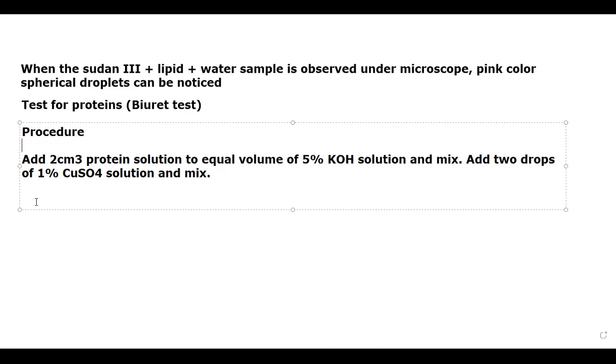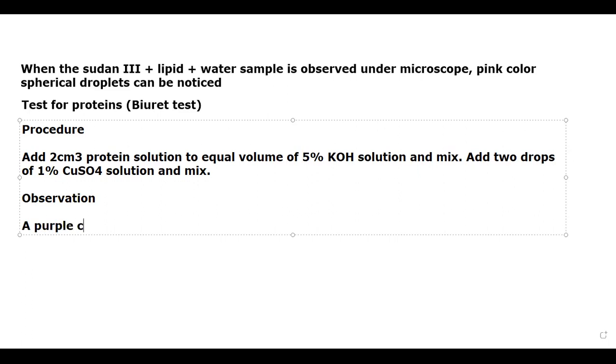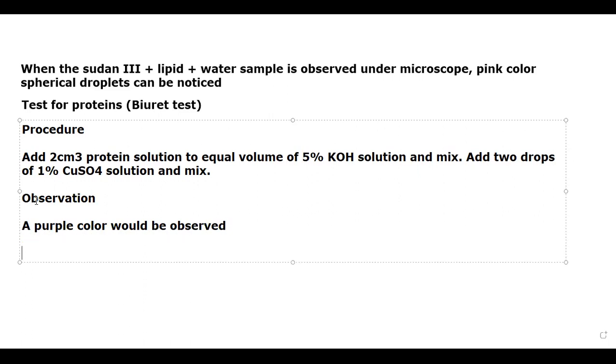Okay. Now, procedure is ready. What is your observation? Okay. A purple color would be observed. Understood? A purple color would be observed. Understood? Complete it. Yes, sir.